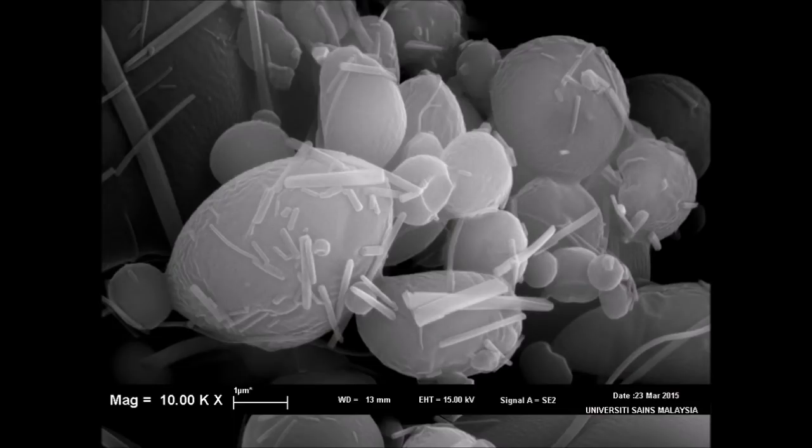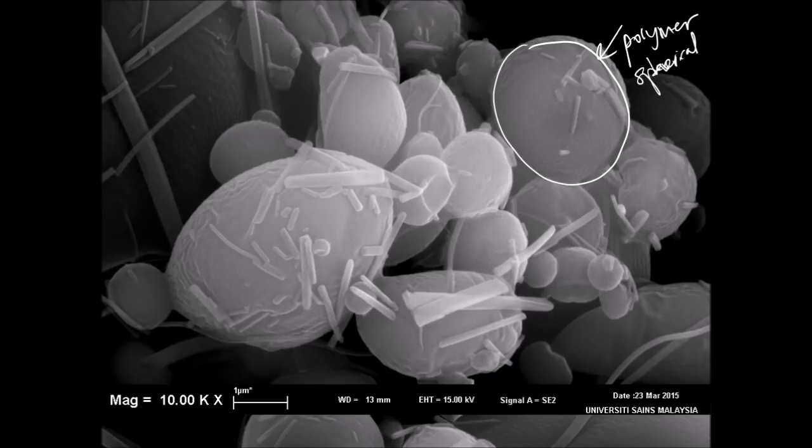And this is an example of an image produced from an electron microscope. Here we found that we have the polymer in spherical form, and in between you see this kind of needle shape, a repetitive needle shape. This is the drug crystal, because they look consistent and systematic throughout the whole sample, where they have this needle-shaped solid on top of the spherical polymer.